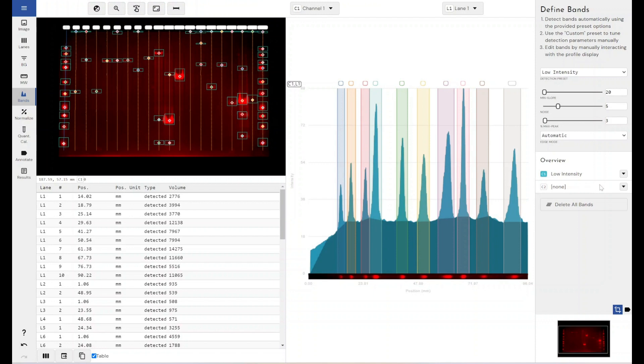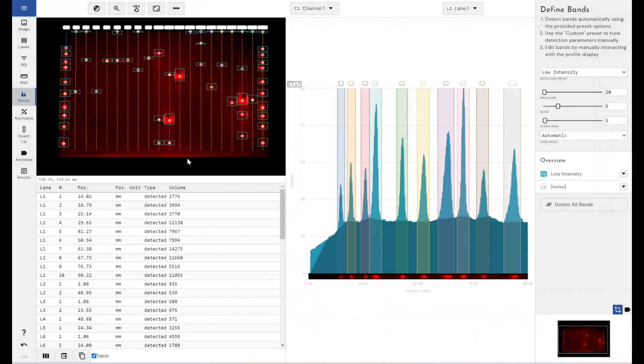So we accommodate that, or if you do want to apply kind of a global preset to all channels, you can simply define the parameters for one channel, come to the secondary channel and copy those parameters straight to the other channel. So you do have that granularity in determining the background removal and the band detection parameters on a per channel basis within our software.